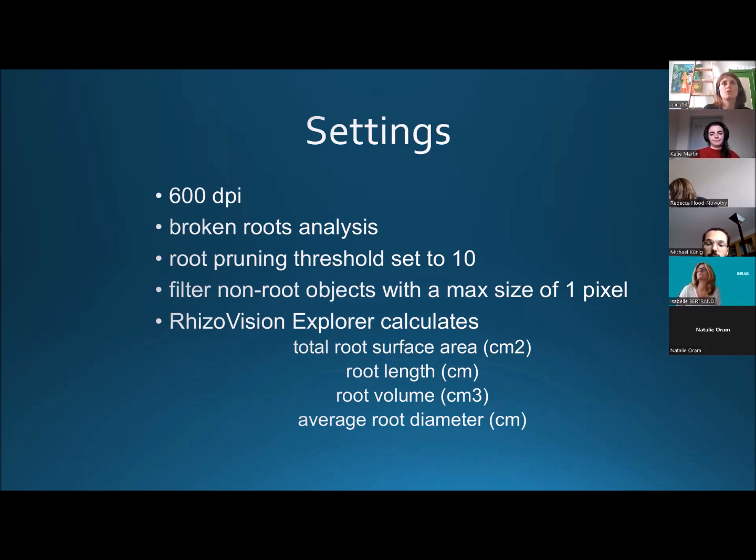And I would definitely recommend to play a bit with these numbers, also to understand it better and how it affects the image. This is very interesting. And then the program calculated the total root surface area, the root length, root volume, and the average root diameter.